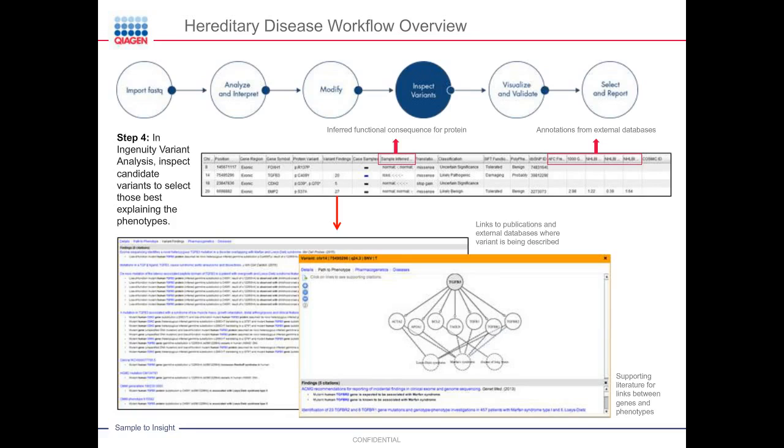Excellent, thank you for that information. Our next question asks, can your trio solution also handle larger insertions and deletions? Yes, it can also handle larger insertions and deletions. Currently, for deletions, we actually do not have a real border, so any kind of deletion we can call. For insertions at the moment it's 50% of the read length.